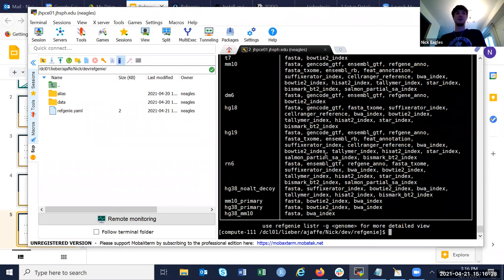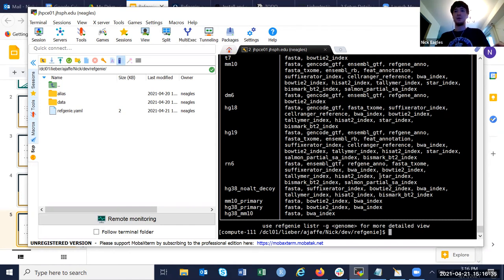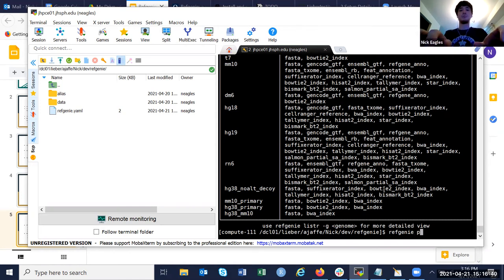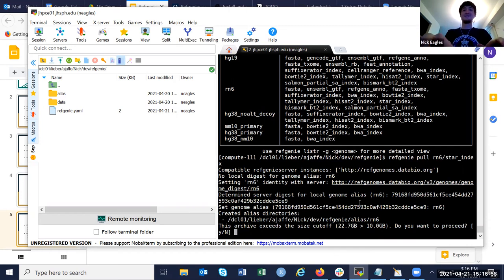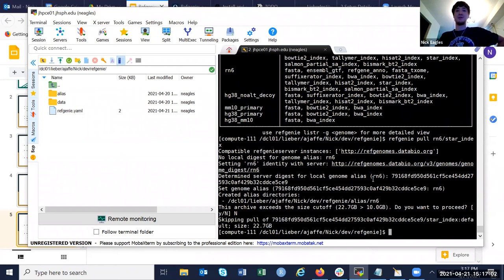If I wanted to get the STAR index for rat, you would just do 'refgenie pull rn6 slash star index.' I haven't seen this error before — I think I would have to set my file size. That's an issue for later probably, but yeah, it's pretty simple.